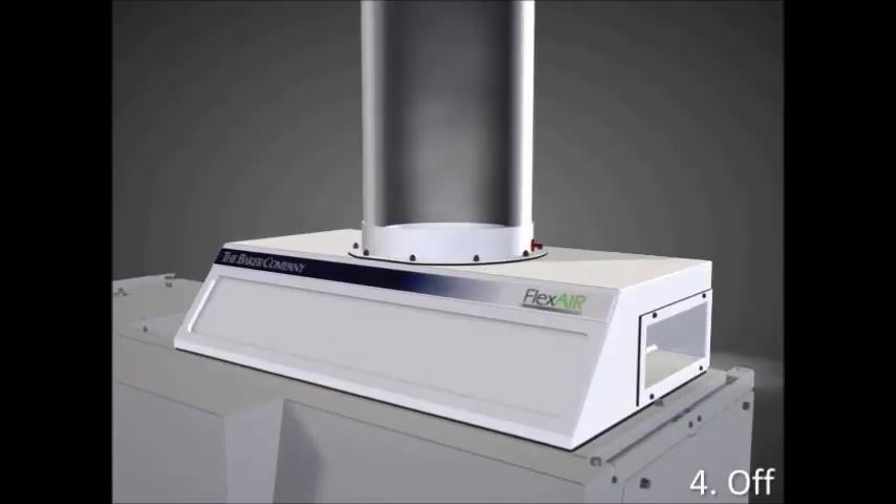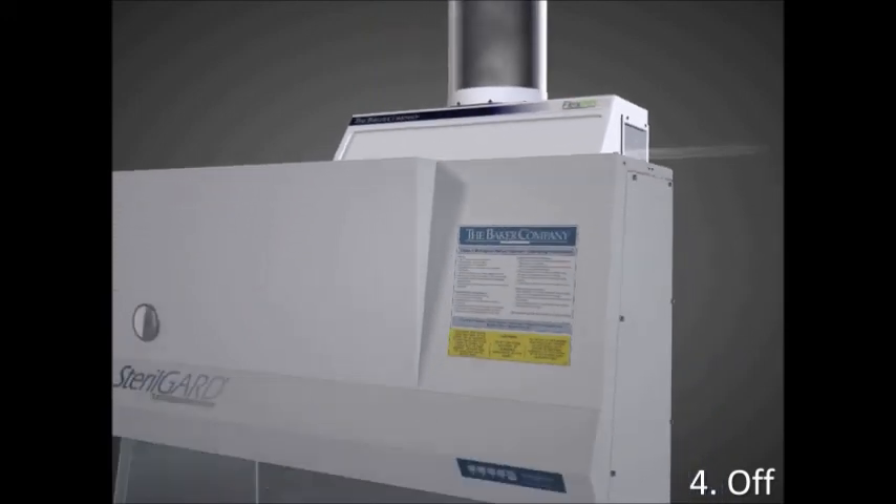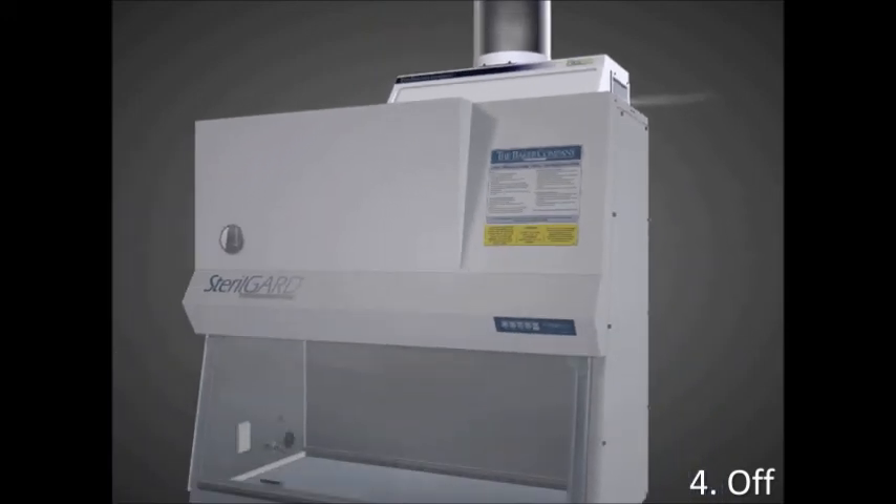When the cabinet is not in use, the side intake dampers will open to allow room air in through the intake ports, therefore avoiding the need for additional ductwork in the exhaust system. Energy requirements can be reduced by about 15% when utilizing the FlexAir. Learn more at www.bakerco.com.